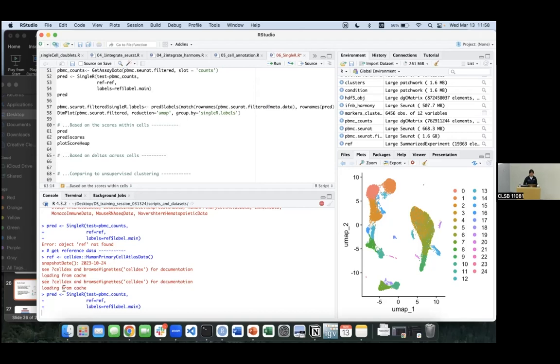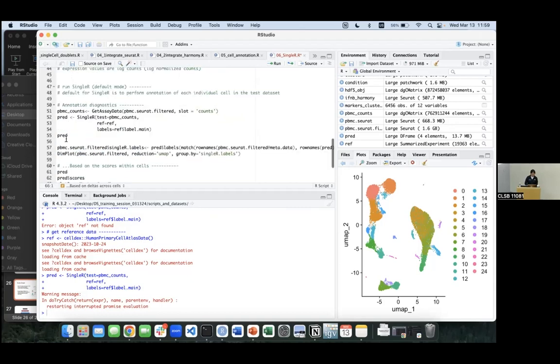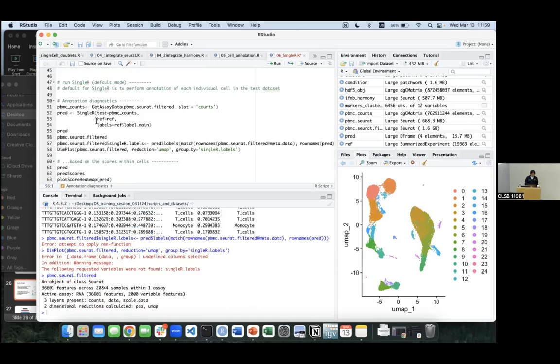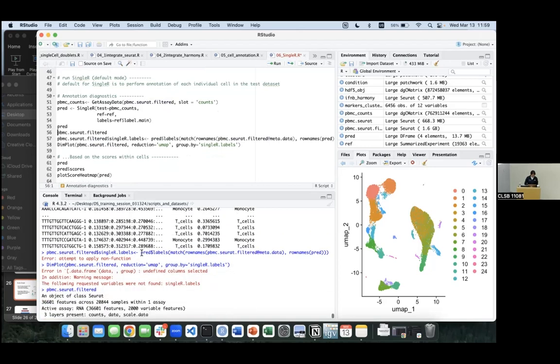Hopefully it can finish running for the first set of assessment. I'll upload everything onto GitHub. So it's already there. You can see all of the scores here, corresponding to each existing cell type here. It's a very long score. We have the scores.